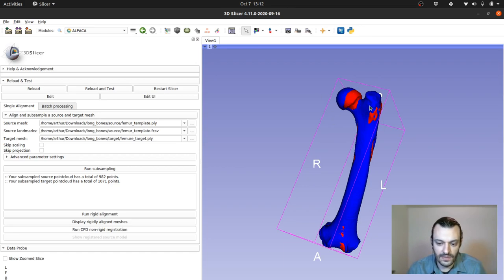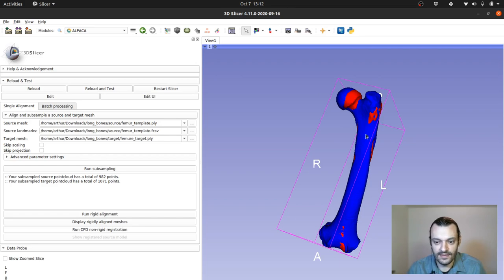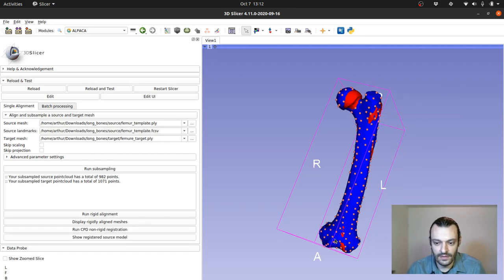Hopefully what we get at the end after the deformation is that after the female mesh gets deformed to match the male one, hopefully what we're going to get is a good transfer landmark so that it covers the male one as perfectly as possible.